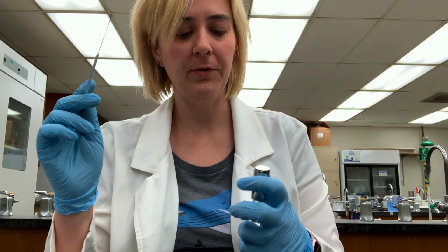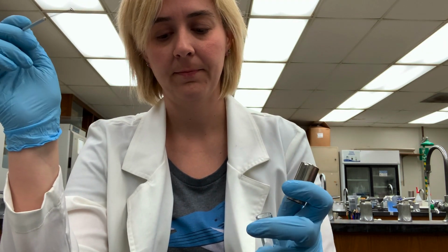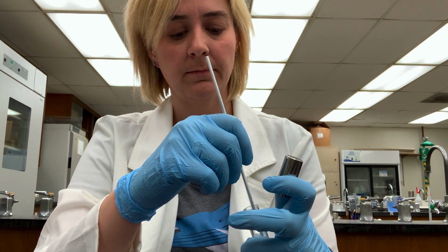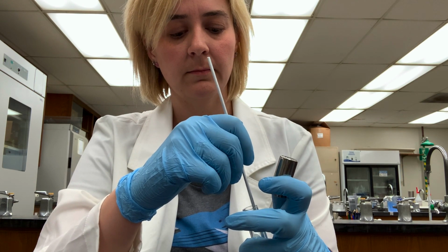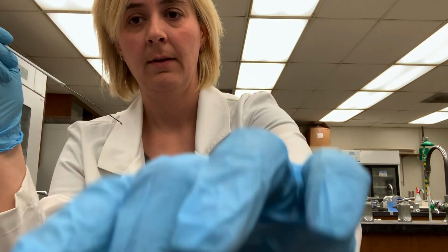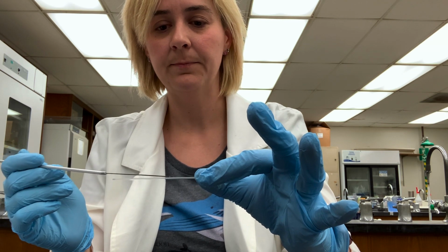So I'm sterilizing my loop just off camera, but trust me, I am sterilizing my loop. Grabbing a slide, and I will take a loop full of bacteria once my loop cools. And I will spread that on my slide.